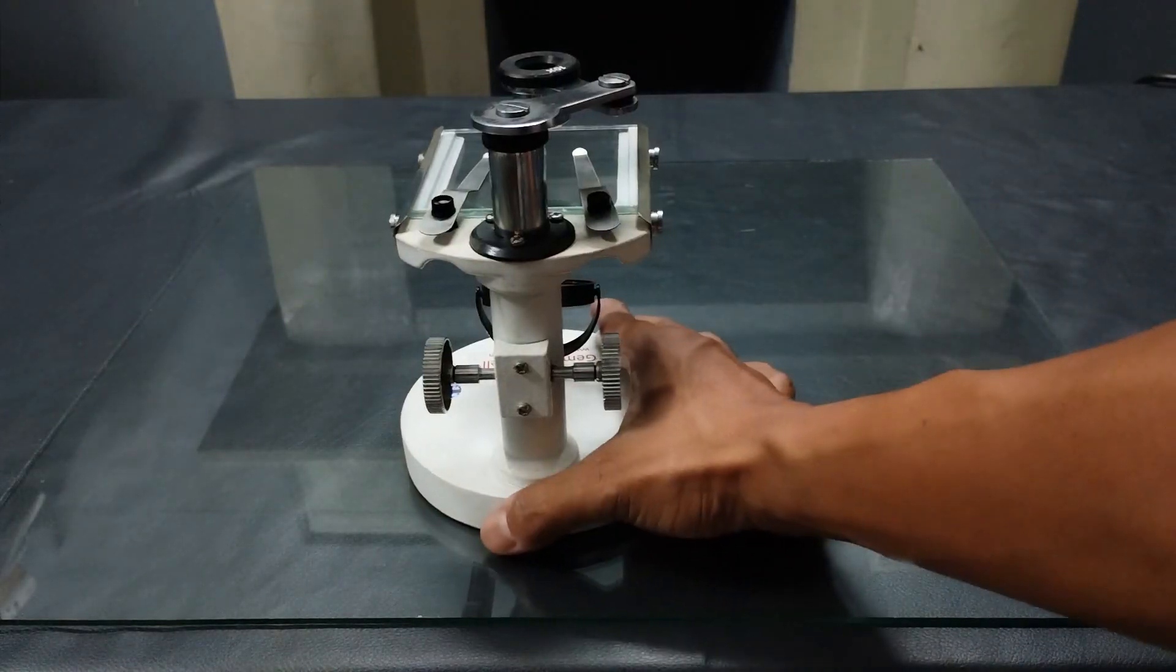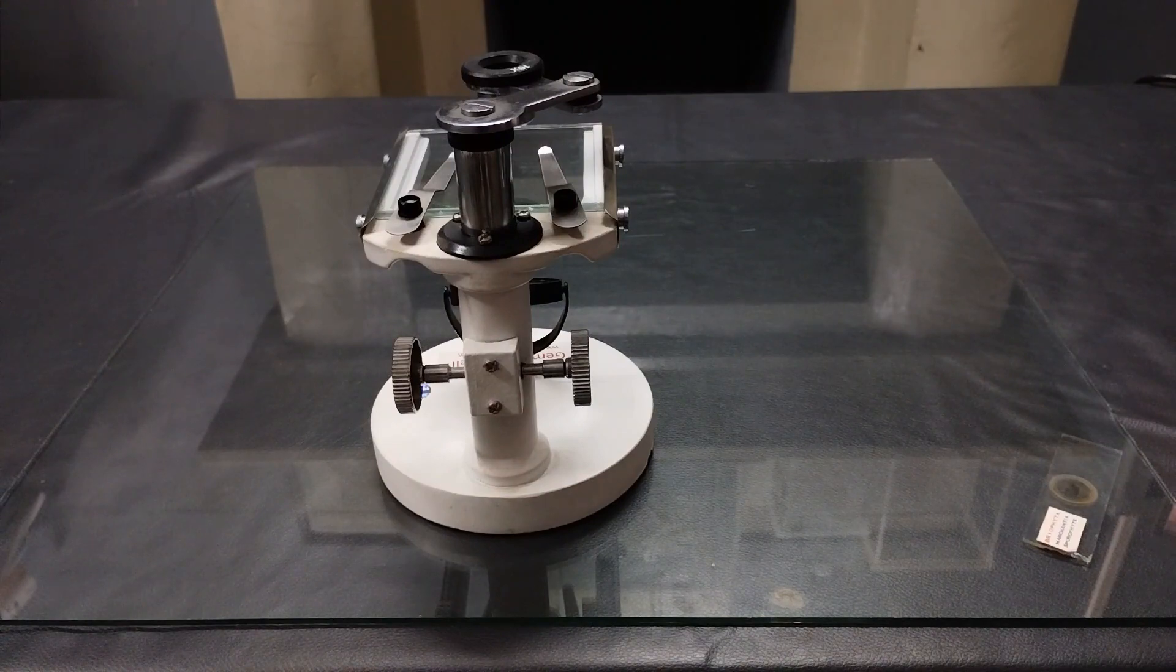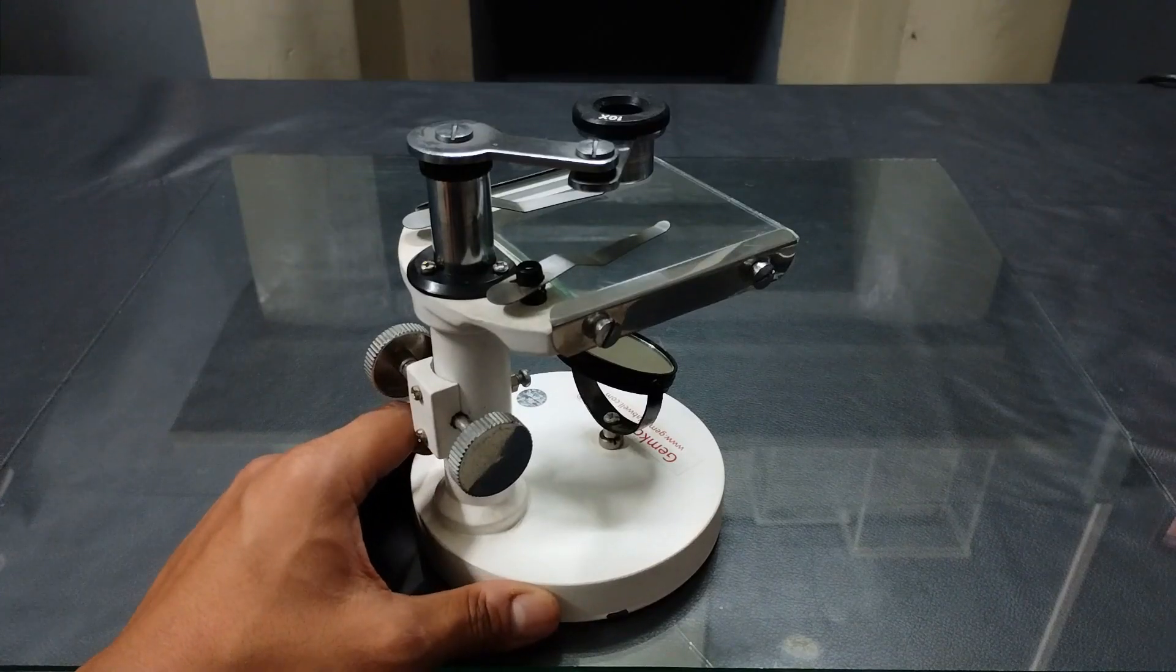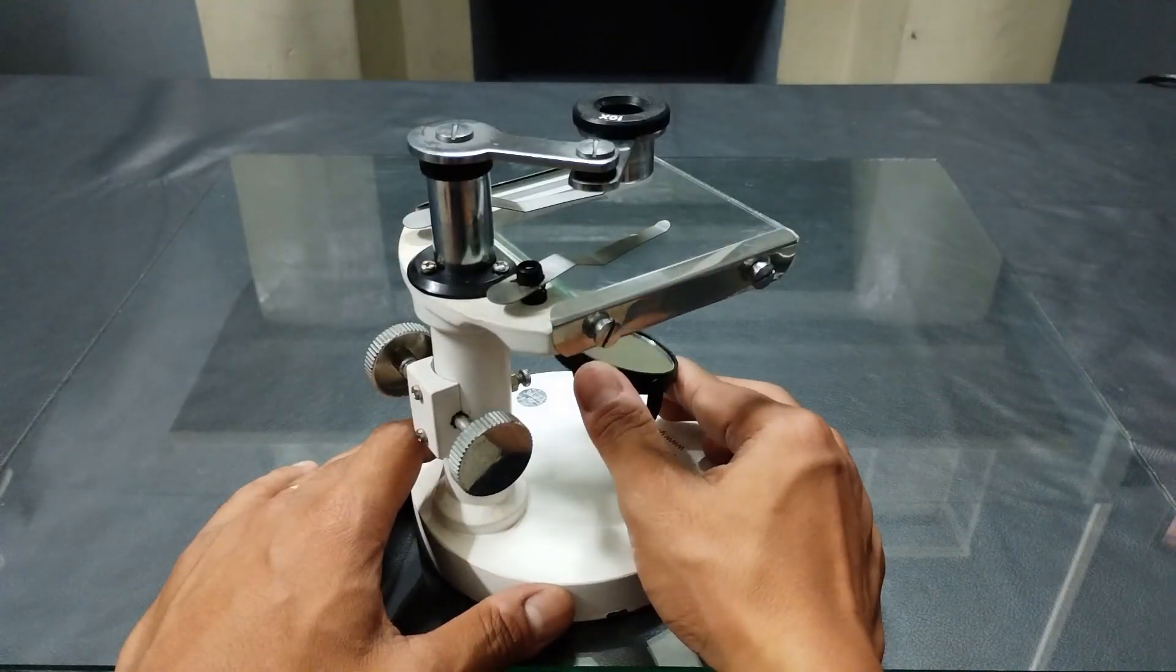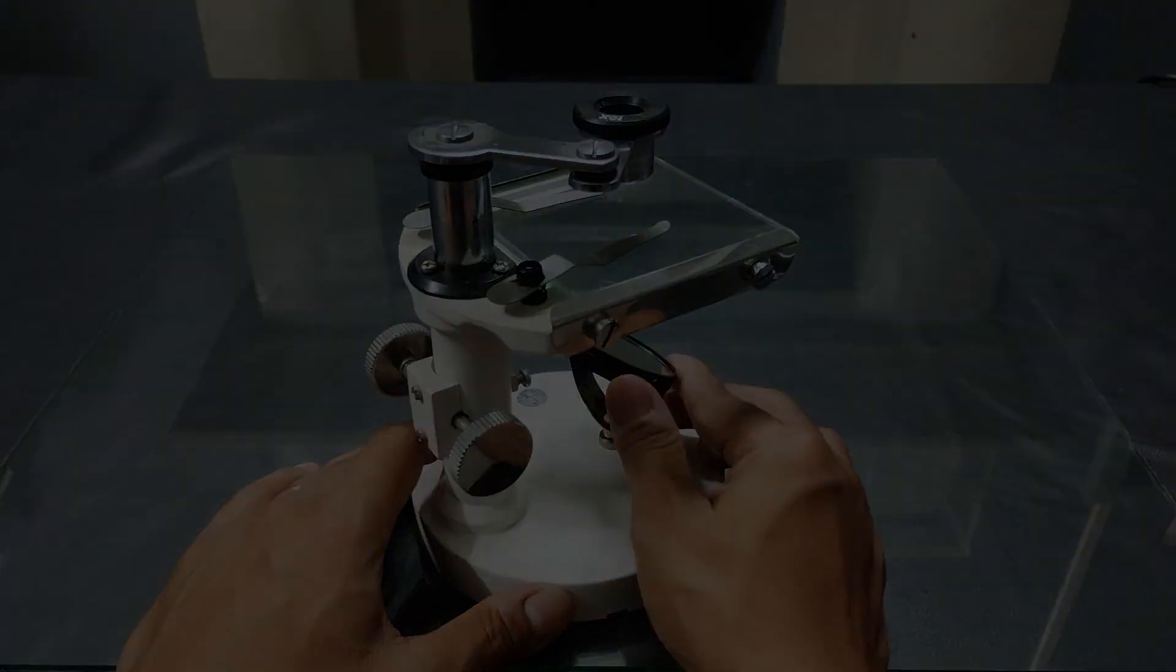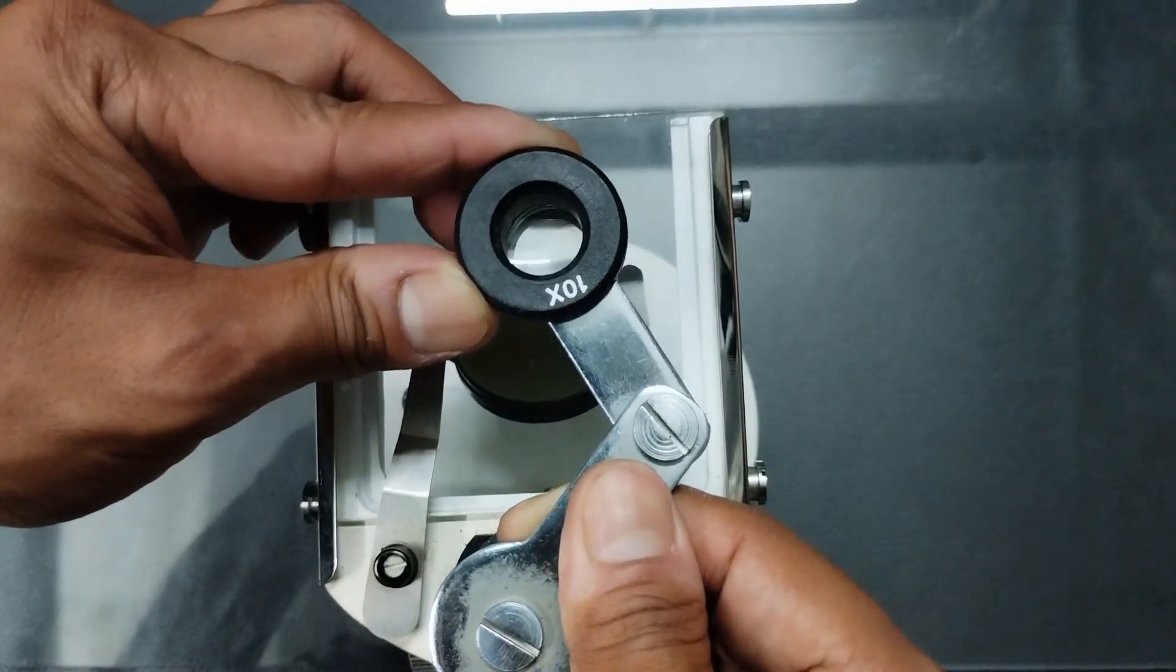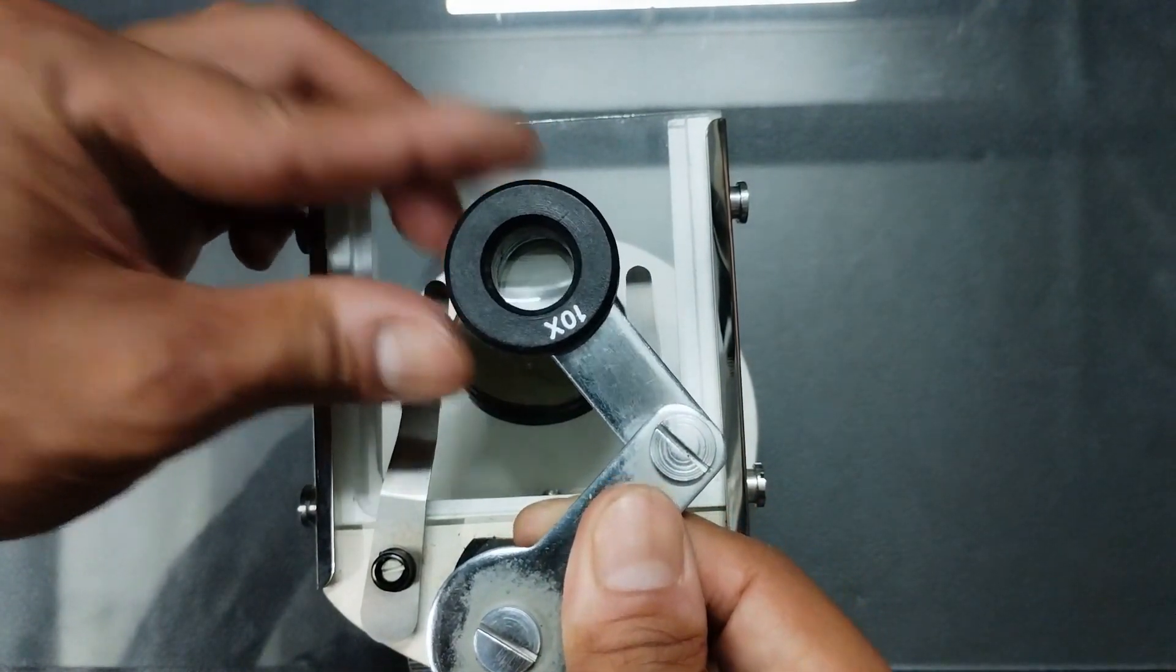To use this microscope, first position it on the working table at a safe distance from the edge. Make sure that the mirror is able to receive bright or diffuse, but not direct light, either natural or artificial. Adjust the foldable arm such that the eyepiece lens is in line with the mirror below and roughly with the center of the glass stage.